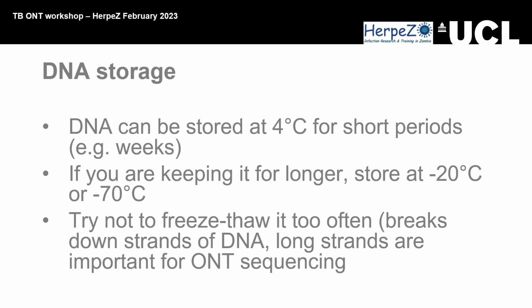So it's always worth, when you've done CTAB, if you don't already, leaving it for 24 hours or as long as possible, and then Qubiting it or doing your quantification analysis, because it probably won't be accurate immediately afterwards. That's not the same if you were doing a spin column based one, because it works in a different way, and you don't have that solid little pellet at the bottom.